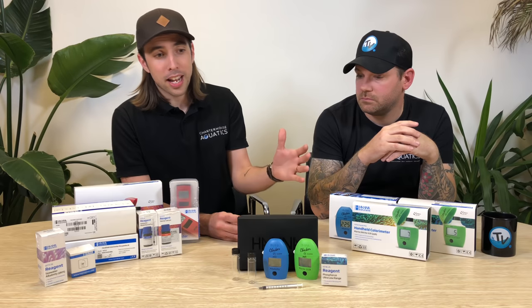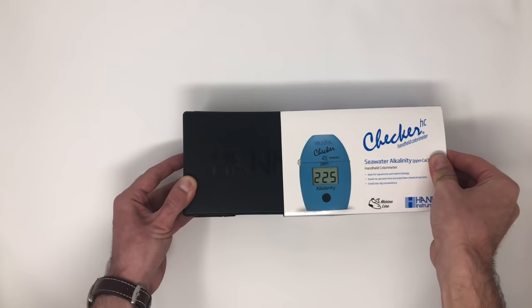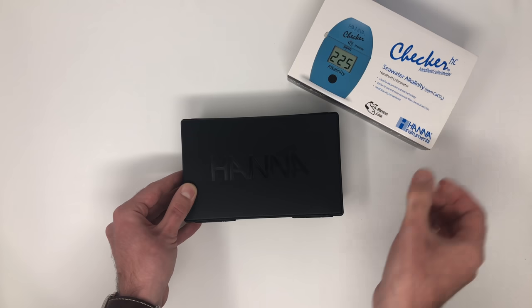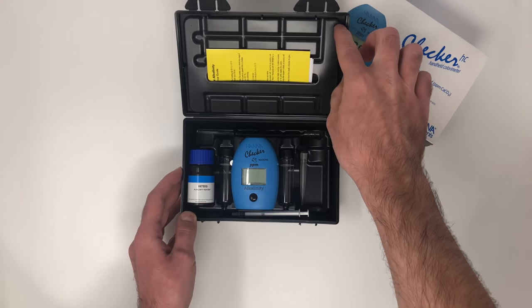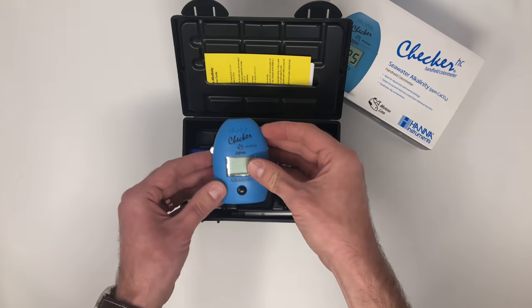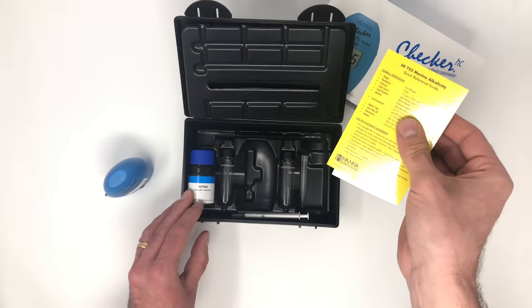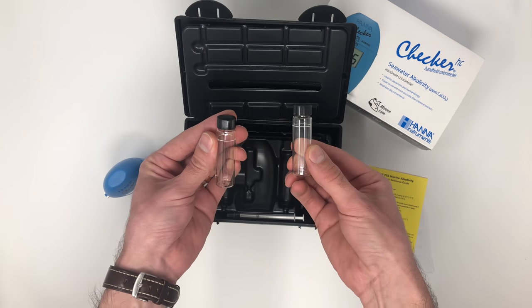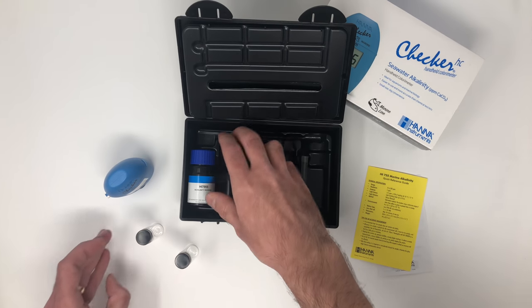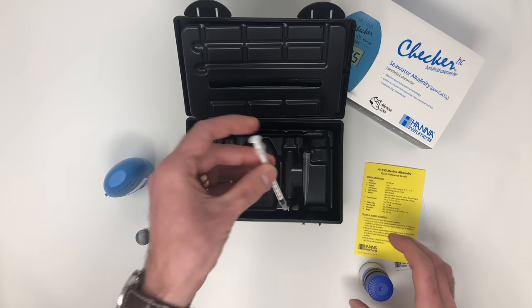Most of that range you're seeing on the table here, and the most popular part of that range by some way are the actual pocket checkers that you can see in front of me. Each one of these pocket checkers comes complete with one of these really practical hard cases. Inside you'll get your actual pocket checker and instructions on how to use it. You'll also get these really smart 10ml glass test vials, the first set of reagents that you'll need, and then depending on what test you're buying, a syringe or a spoon.